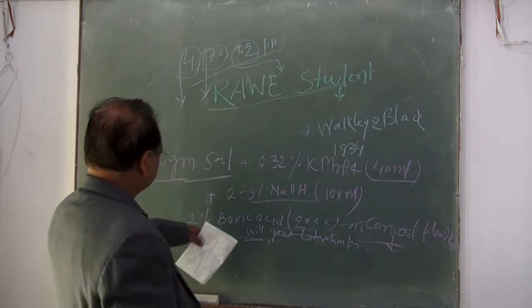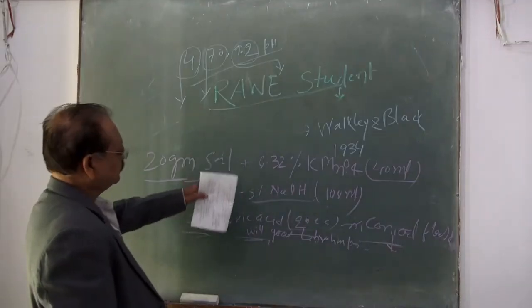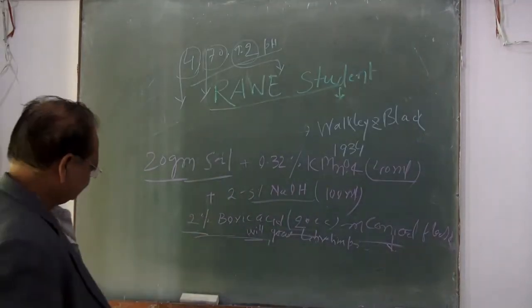So this is the whole methodology of the Kjeldahl flask.